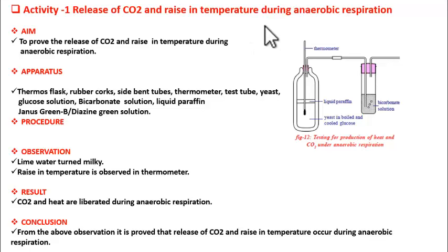Good morning students. Today I will explain the activity on anaerobic respiration. This activity is to prove that release of carbon dioxide and rise in temperature occur during anaerobic respiration.